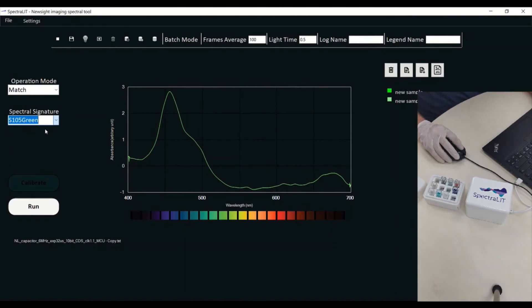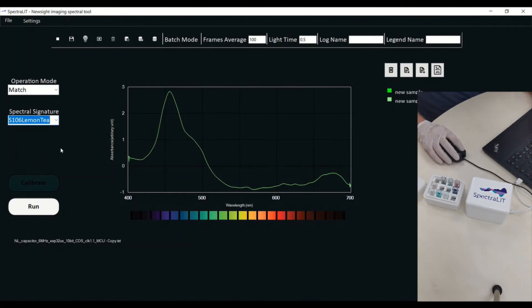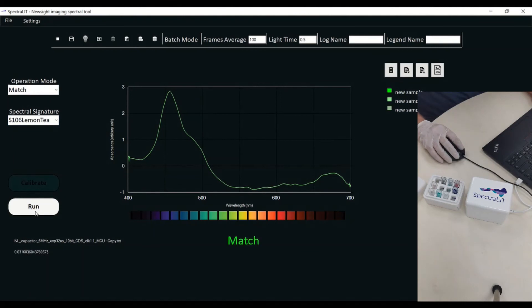For example, I'm going to put this lemon tea here. This is the lemon tea. Now let's see if what I have here is actually matching the lemon tea. I'm pressing run and it shows match.